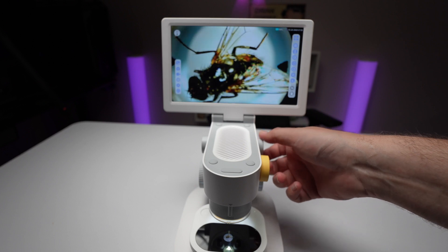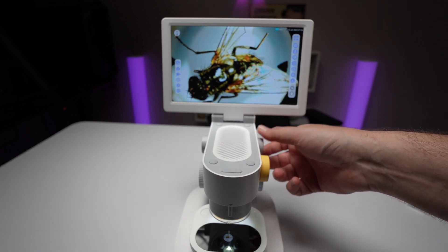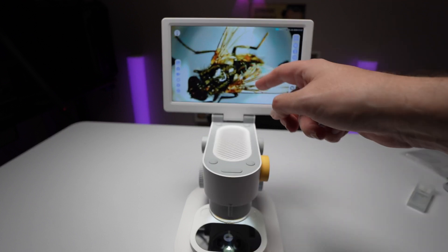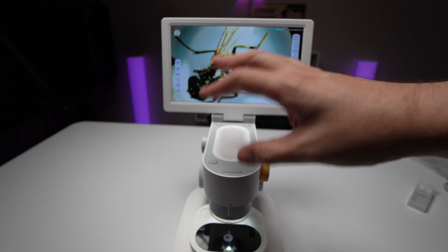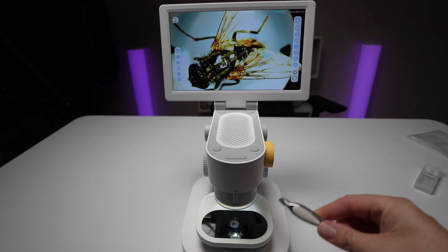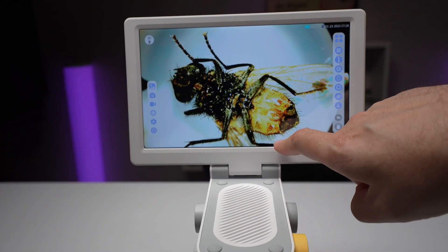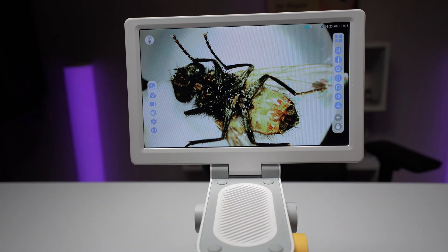I do have a fly on here as well. I saved this fly from a prior microscope and just had it in a little baggy for another chance like this. Right now we are just on the 100 times — if I try to zoom in to the 600 times I can't get it to focus. But as you can see, even with the 100 times you can see that fly pretty darn well. You could even get all the little individual hairs, so I'd say this microscope does a pretty good job.